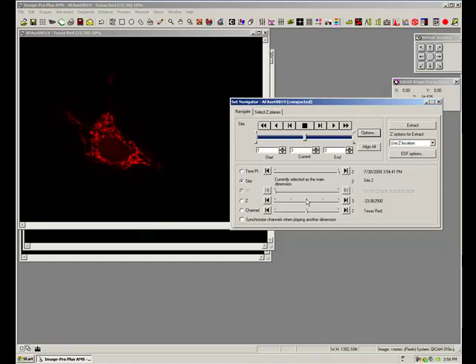It's a very straightforward package. One of the great things about that is the memory handling when you're opening up these sets means you can do really long, complicated time-lapse routines now and not let the PC be the problem.